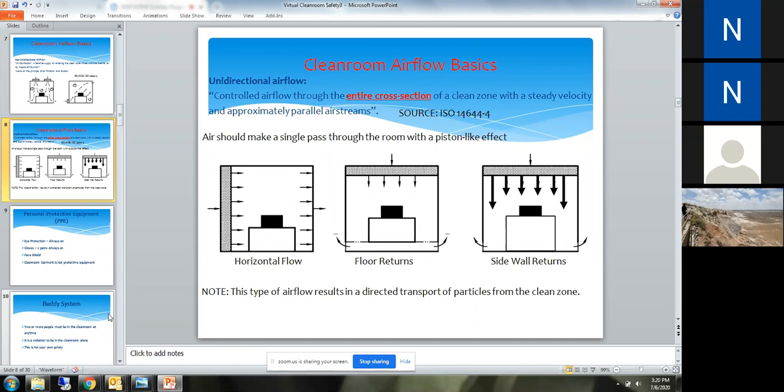But if you know that you are going to go to the clean room and you want chapter 5 of that, you can copy that chapter and we can print it on clean room paper, and then you can have it in the clean room. Or if you have a recipe that you are going to try in the clean room, before you print it out, you can email a technician, your professor, or anybody that has access to clean room paper, or you can get in the clean room.